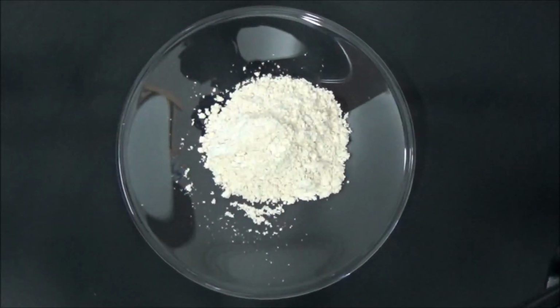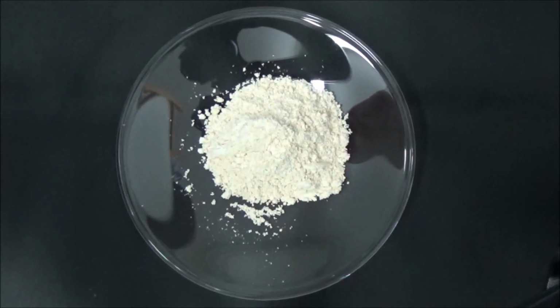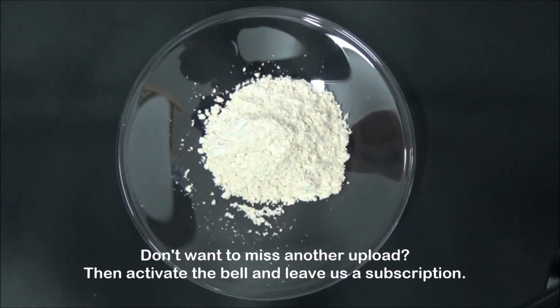After 24 hours of open drying at room temperature, we got a bone-dry crumbly substance, which we then easily crushed into a fine powder. The weight was 4.6 grams, which corresponds to a very satisfactory yield of 83.8% compared to the theoretically achievable amount, taking into account the total amount of barium hydroxide used in excess.